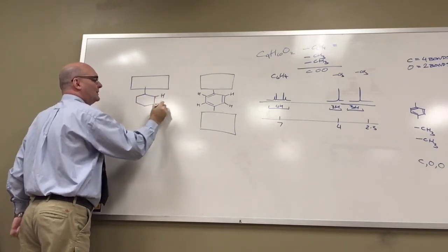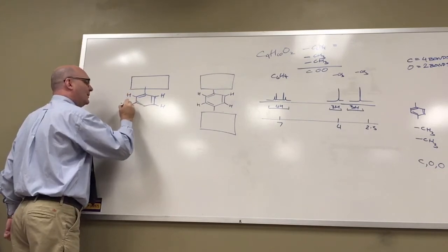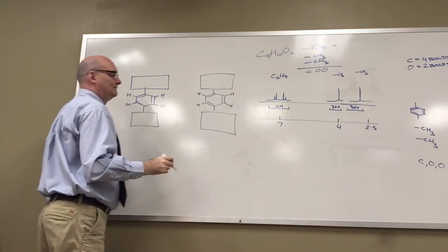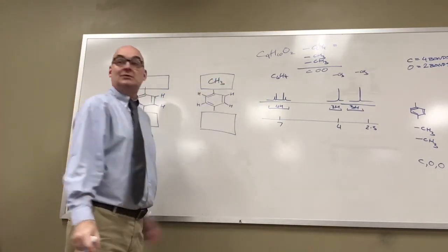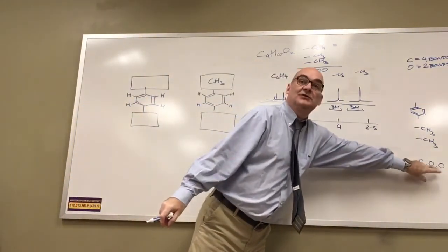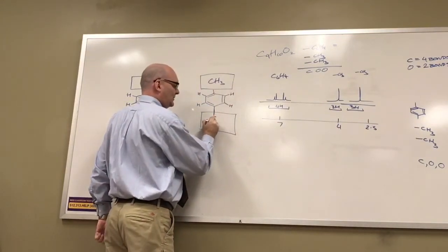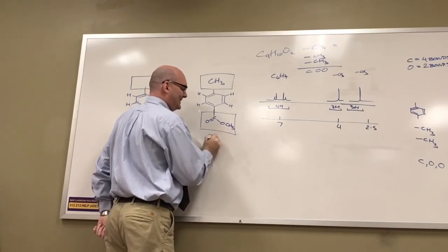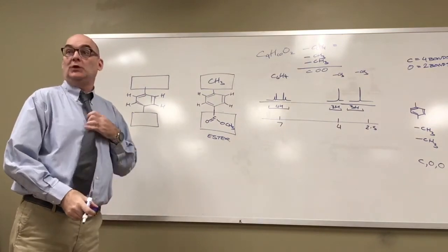And this is where the software might jump in and help you. The correlation table on the back page is here to help you. If I put one of the methyls directly attached to the ring, then both of my oxygens have to be in the other group. Well, that's not a problem at all, because that is an ester. You can do that.